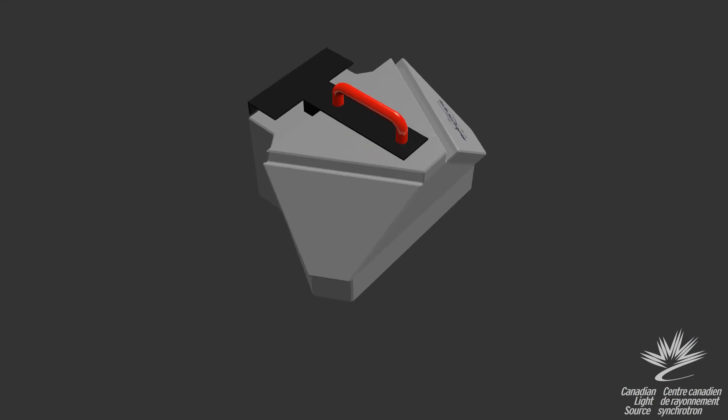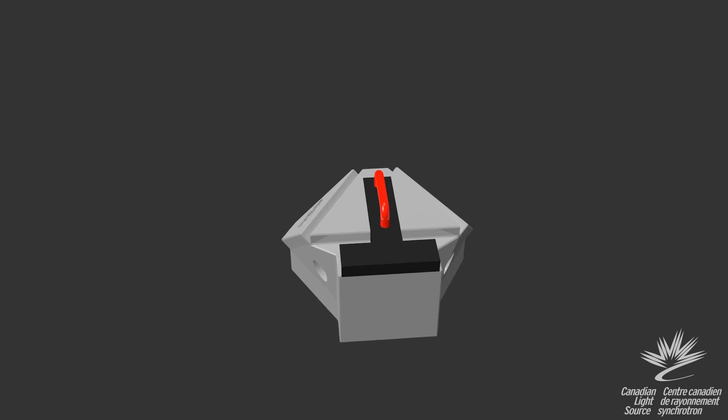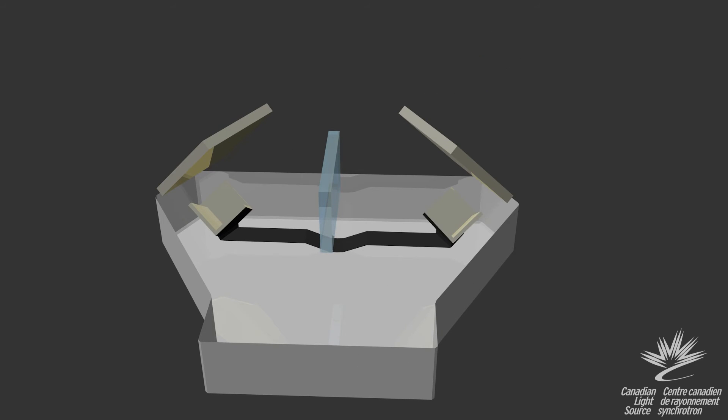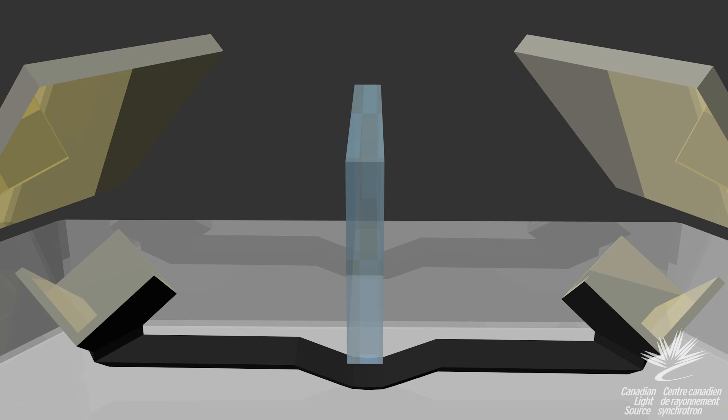The Bruker rock-solid interferometer does not have one moving mirror. It actually has two cube-corner mirrors which sit on a rocking lever. The cube-corner shape is able to reflect light in exactly the same direction as the incident beam regardless of the mirror orientation, mitigating alignment problems encountered by the original interferometer.